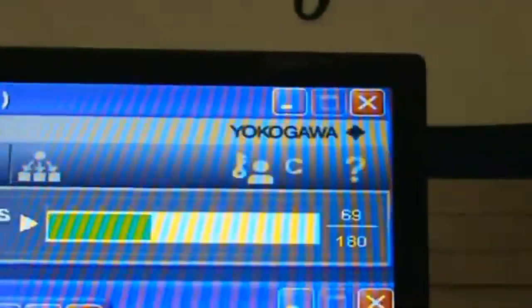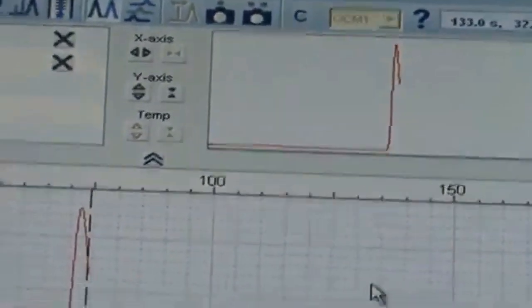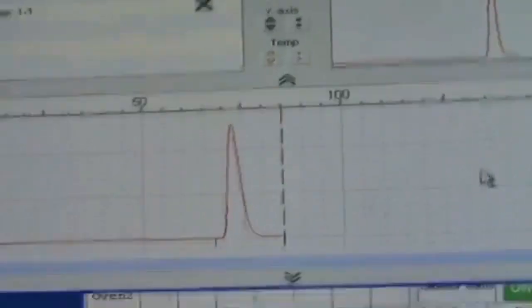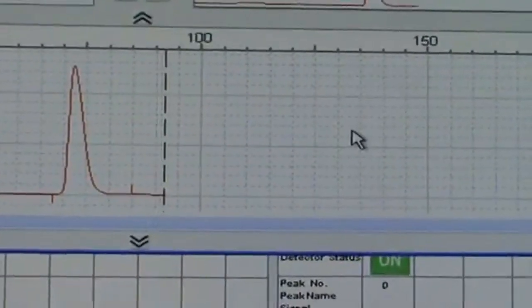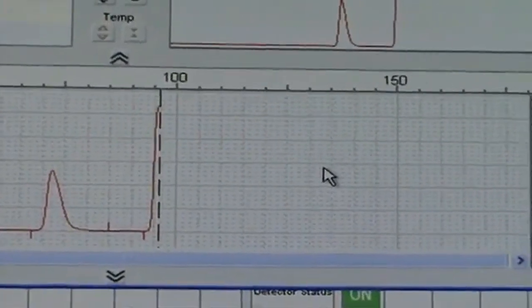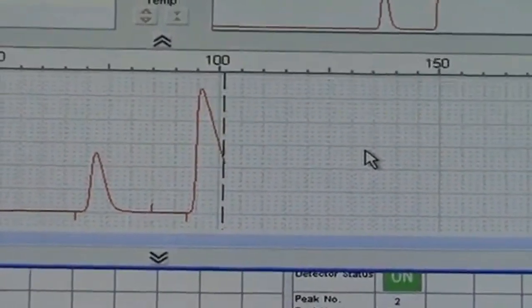There's our time clock for our cycle time. We're getting a peak. There's our gate right there. And we made these time gates. We could have done slope gates, but I think we chose time gates on this instead of slope gates. And then there's the off gate. And there's an on gate. And then there's our peak. And we probably need to move that a little bit.